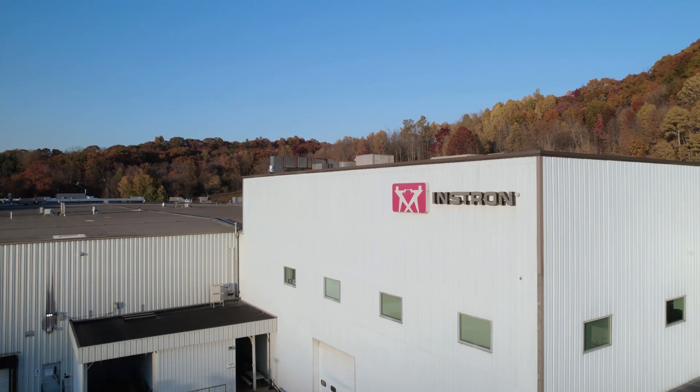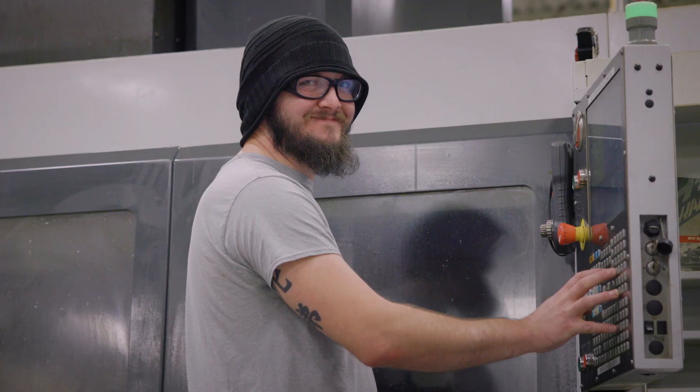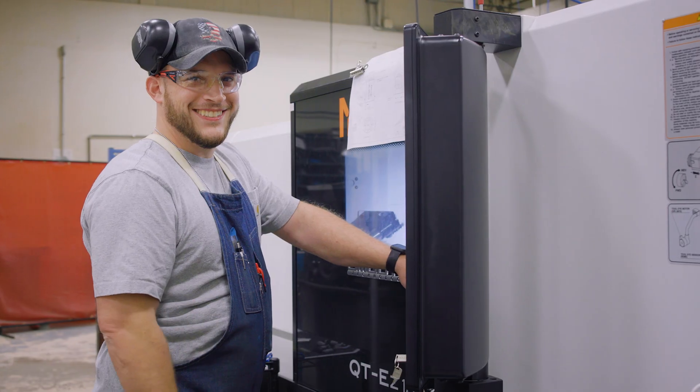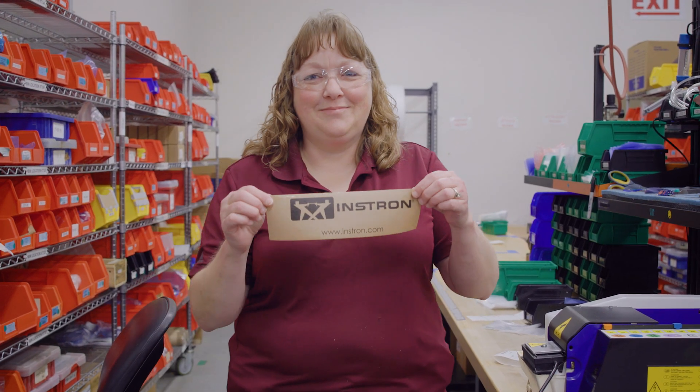At Instron, quality is more than a process — it's a commitment. Behind every Instron product is a team dedicated to manufacturing best-in-class testing equipment you can trust to protect your brand and your operators. Instron: the difference is measurable.